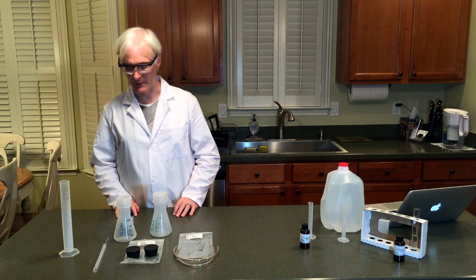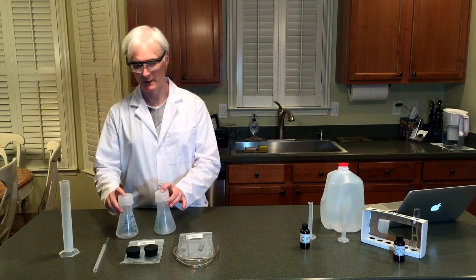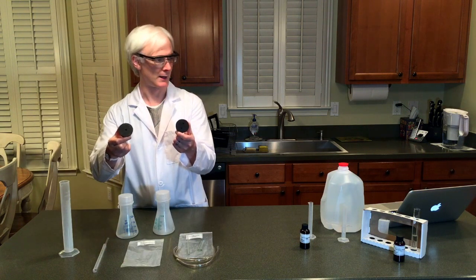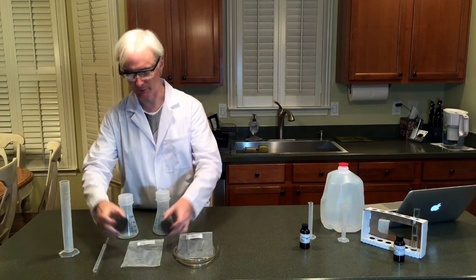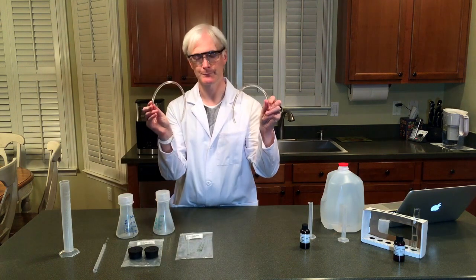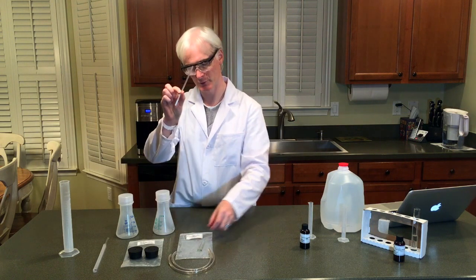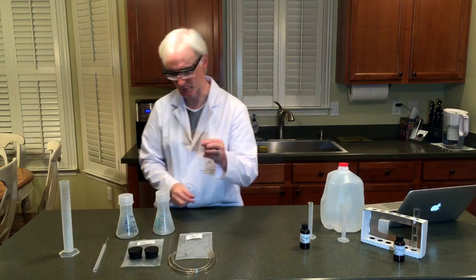We've got our safety measures taken care of, so let's go through the apparatus that we're going to set up. We've got two Erlenmeyer flasks. We also have two bungs here, or stoppers — one has one hole, one with two holes. A little trick with those later. We also have flexible rubber tubing, two pieces. We've got one rigid tubing glass — be careful of these — and we've got some smaller ones also.